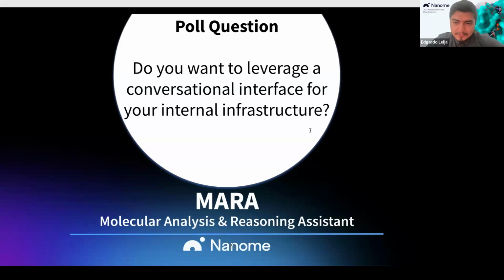There's another question around the Mara roadmap. What are future functionalities users can anticipate for Mara? Any thoughts there, Sam? Oh my God, there's so many things. Yeah, we have an aggressive roadmap, so we'll see how it actually pans out. But a lot of the big areas that we're focusing on are, we've been focusing a lot on tool extensibility.